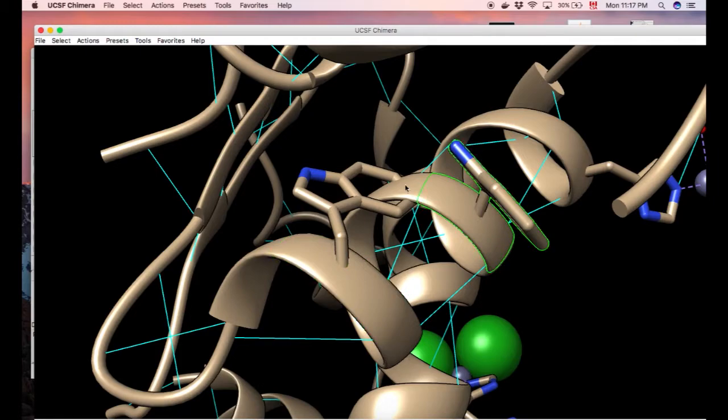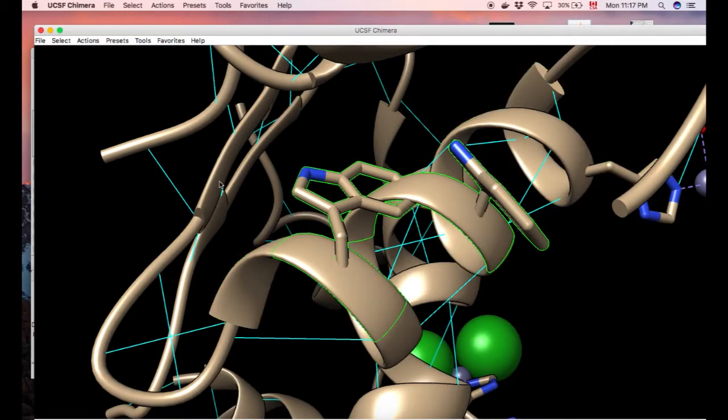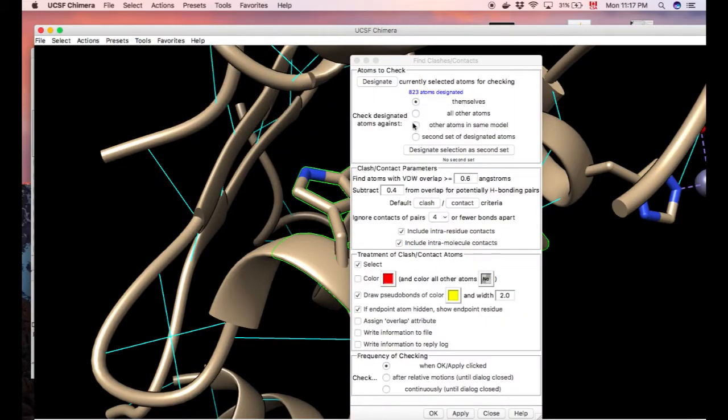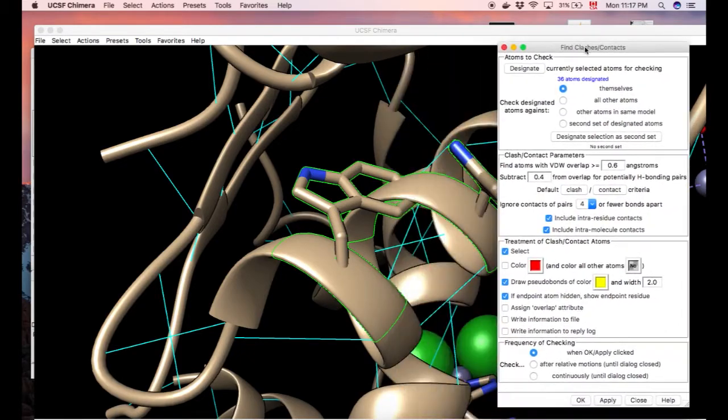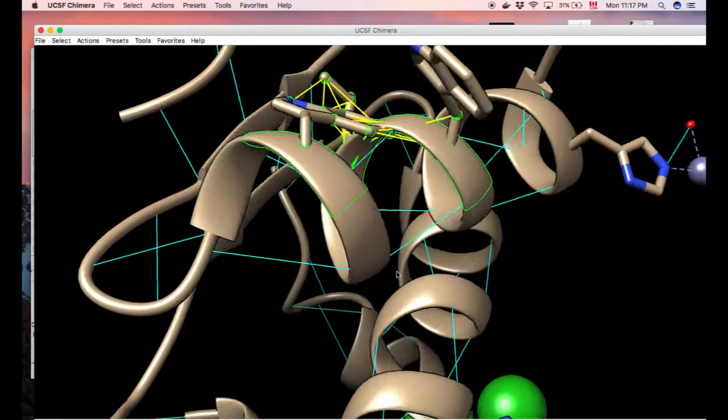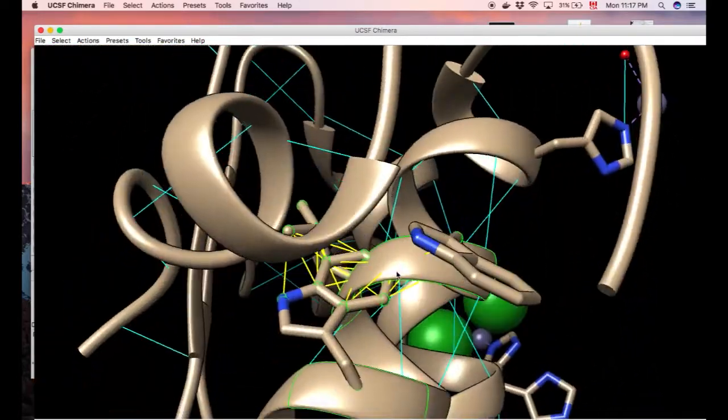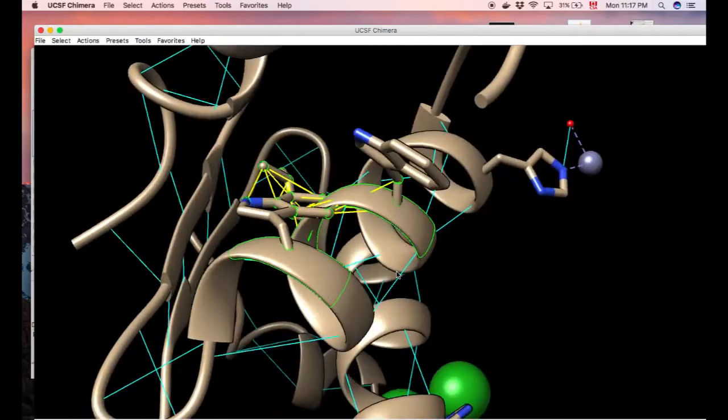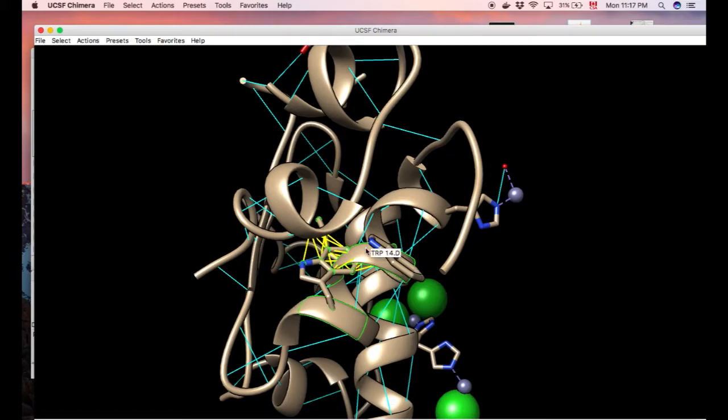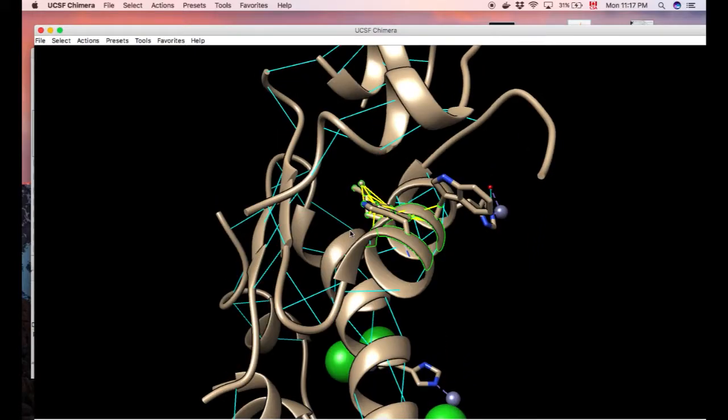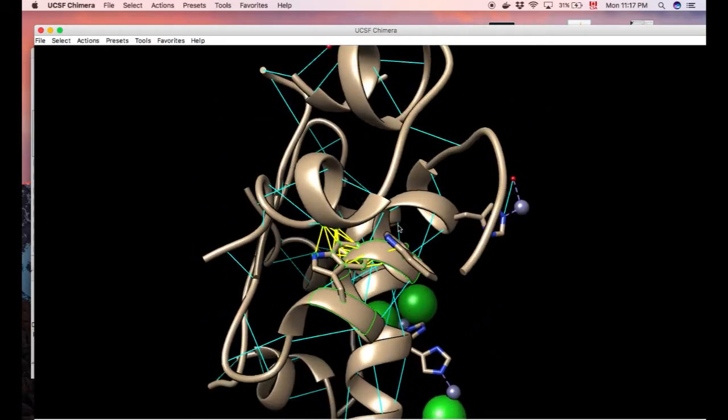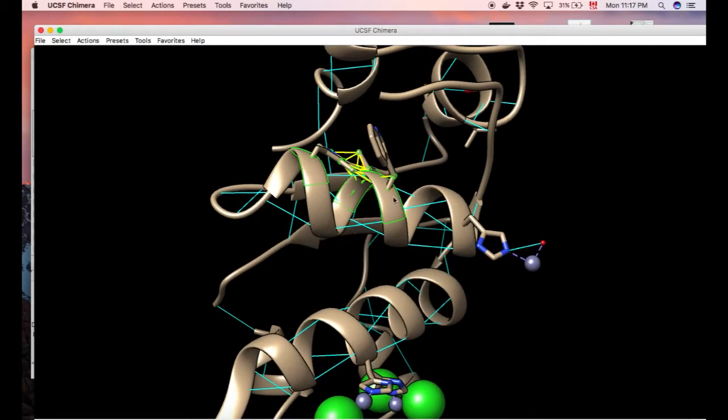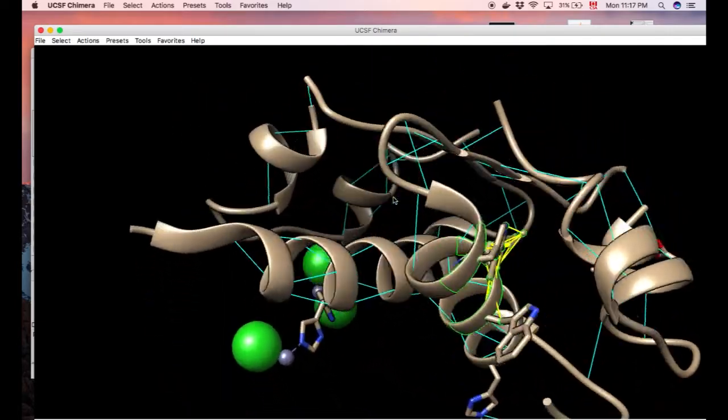So let's analyze this position, select everything, tools, structural analysis, and clashing contacts. So if we designate those new 36 atoms, there's a huge amount of interaction, of clashes, of contacts. So what does that tell you? What if you get mutation in here? Well, there's a high chance if you're losing any affinity for the insulin receptor or any function. Maybe there's no hexamerization in the cell. Well, maybe there's a disruption and it's not happening anywhere. It's probably happening between these three amino acids, right? So that can be a head start for further analysis.